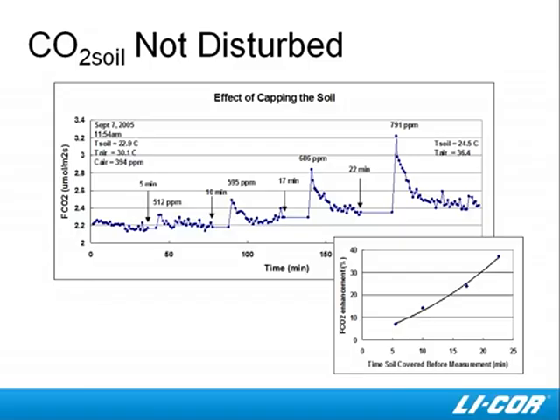One of the other approaches that we use to avoid disturbing the soil CO2 concentration is that our long-term chambers are actuated chambers. They're only closed when we're making a measurement, and we make a measurement for a short period of time. In the top figure here, we're showing the measured flux over time for a bunch of repeated measurements. In this first measurement, our chamber has been open, we let it close for 5 minutes, and we measure the flux.